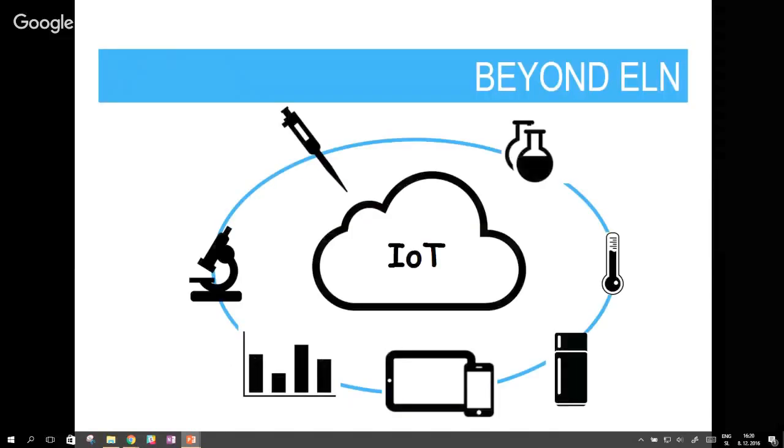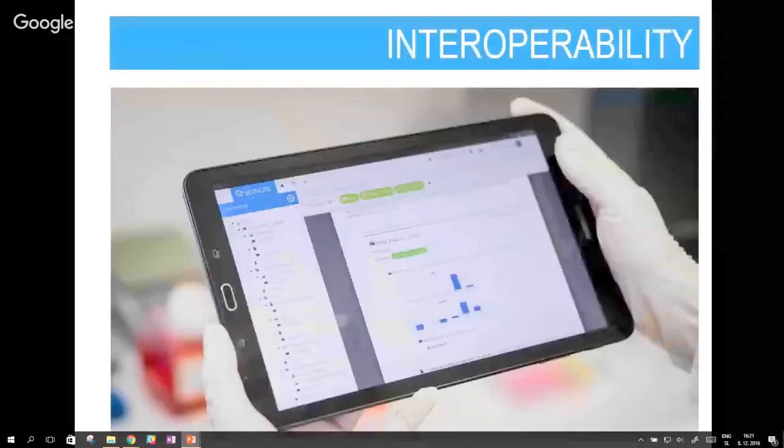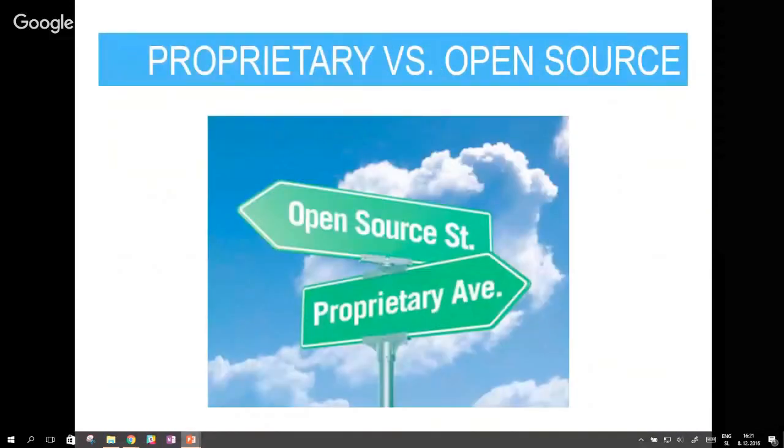An important thing is that if we want to connect all of these devices, we will have to standardize the way that these devices talk to each other. So standardize how the data is created, how the data is shared. And a lot of this can be done by opening up. I'm not just talking about open source software, I'm talking about open standards, open APIs. So anything that will help other vendors connect their devices to your device, and not just them, but also scientists.